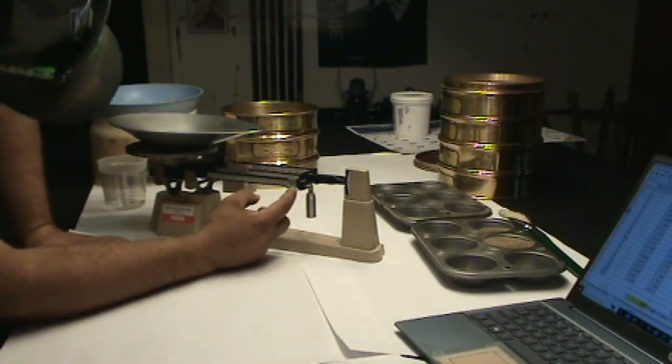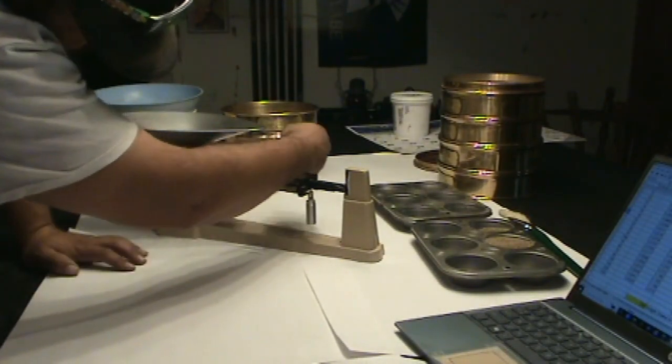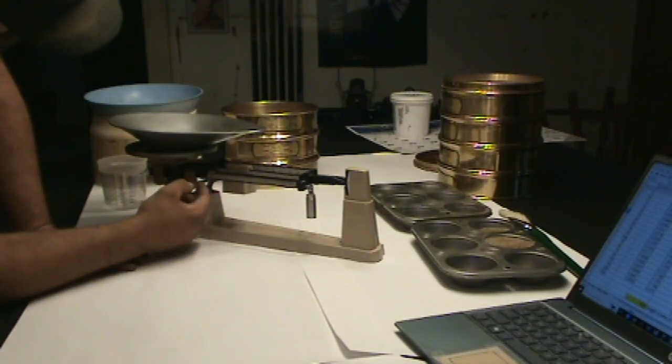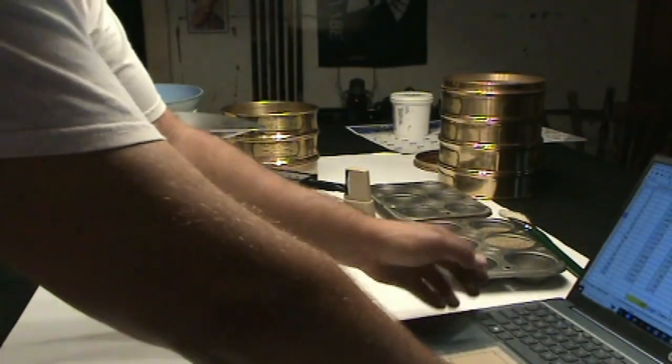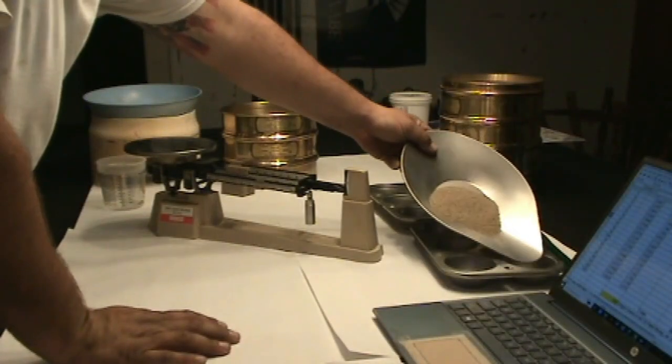We purchased our sieves to do analysis on samples from monitoring wells that the State Water Board was requiring around dairy lagoons. The procedure was basically the same, except the shaking had to be done manually. Boy, was that tiring on your arms.